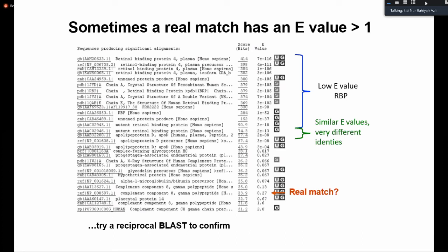As I've mentioned previously, a high bit score will normally have an e-value lower than 0.05, which is a good thing. However, a similar e-value that is statistically significant, still lower than 0.05, can come with very low bit scores. Is it still possible? It is still possible.